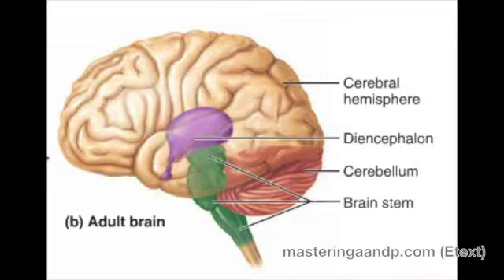This image depicts the cerebral cortex. The cerebral cortex is the outermost covering of the brain. As shown in the image, the cerebral hemisphere is the beige-colored area of the brain. The cerebellum is located below the cerebral hemisphere, as indicated by the color red. It coordinates the timing for skeletal muscle activity, controlling balance and equilibrium.